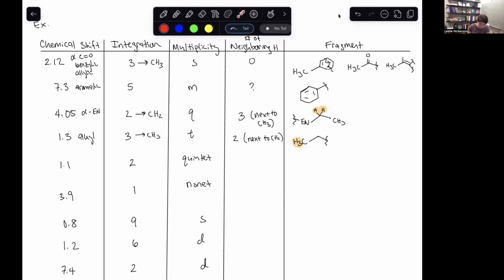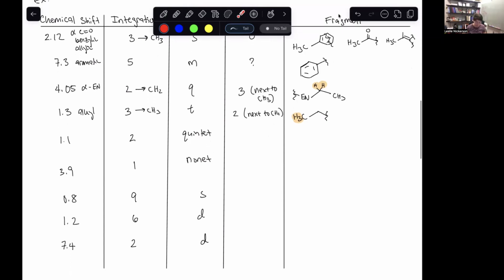But what that does tell us is that when we have these two together, we've got some overlap here where this CH3 could be that CH3, right? So the ethyl group that I drew here could be showing up as another fragment somewhere else in your spectrum. And again, keeping in mind, none of these are actually going together into one single thing. It's mostly just single fragments that I'm looking at here. And again, that context is really important.